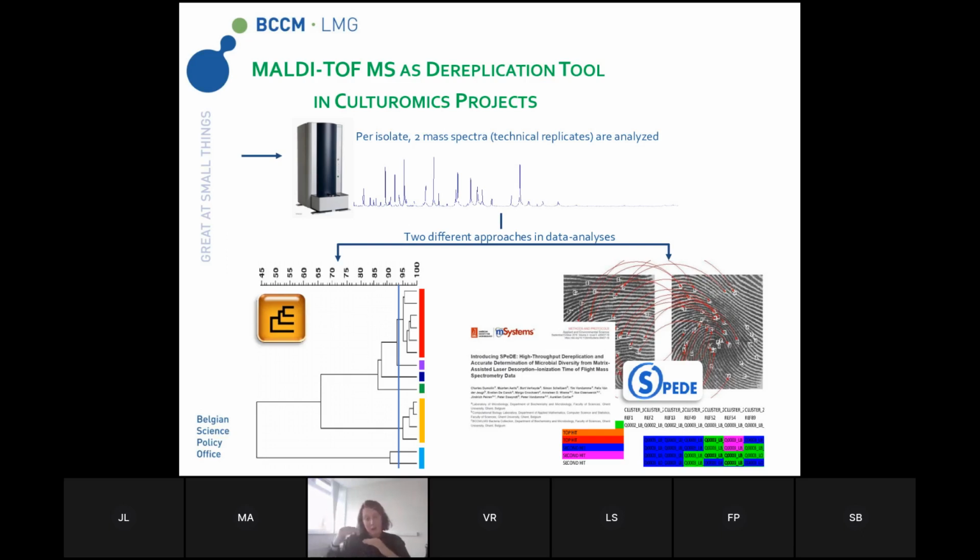And if you have all those unique patterns chosen out from your bunch of mass spectra, you just compare all your other mass spectra to that particular reference spectra. So in the first case, you get your similarity matrix, but in this case, you just get a non-metric similarity matrix where you have all your unicities present and all the other mass spectra that have the same unicity linked to that one. And you also get an overview of your operational isolation units, as we call them.